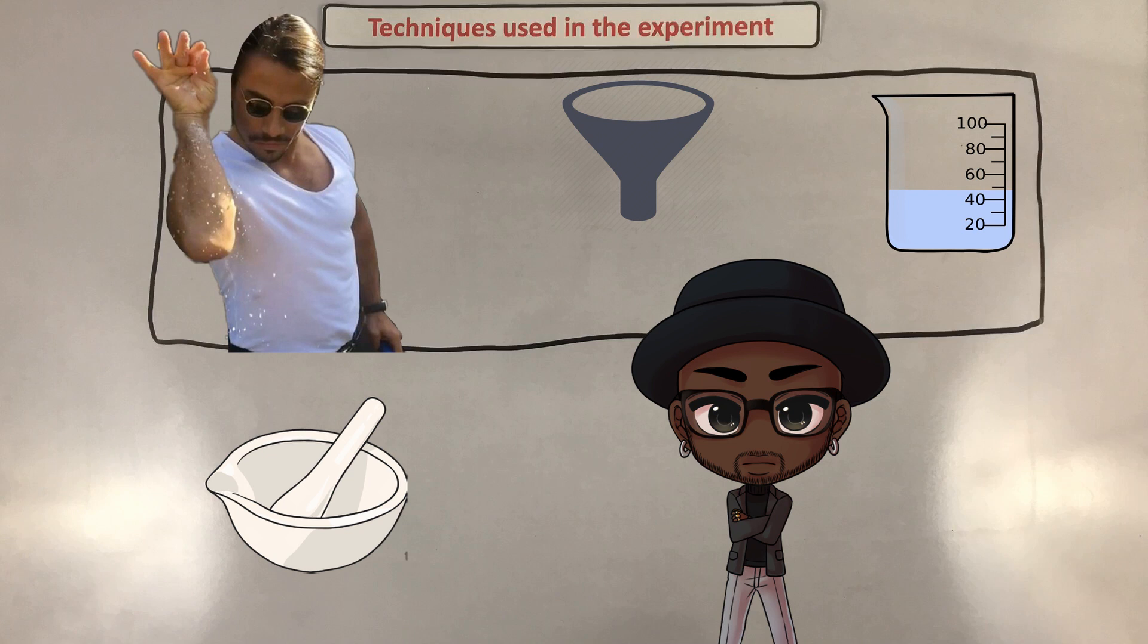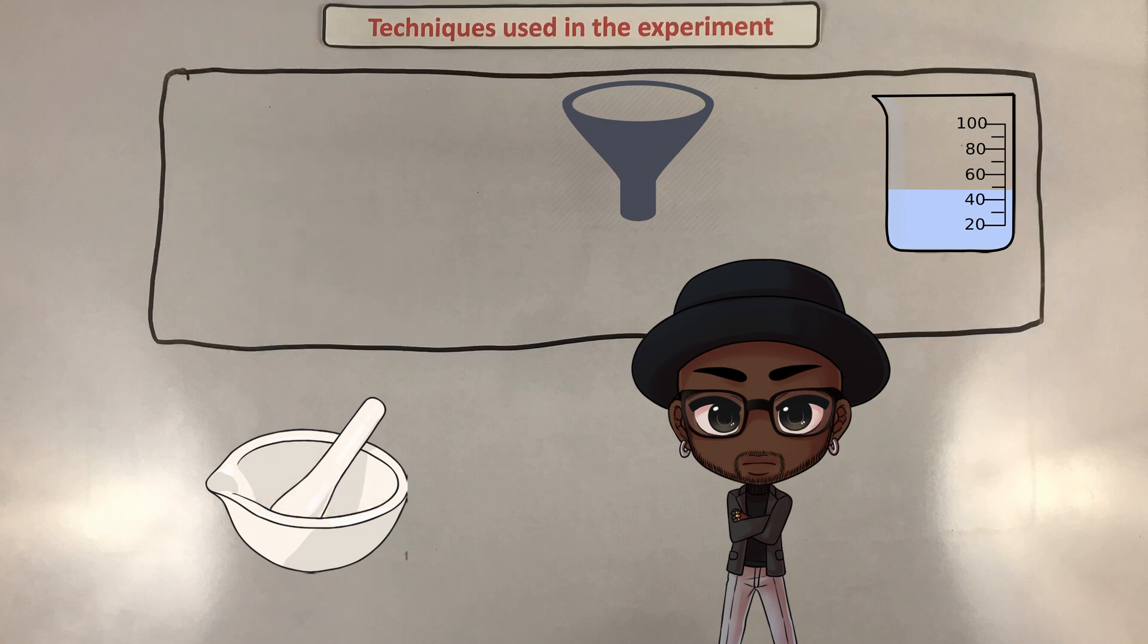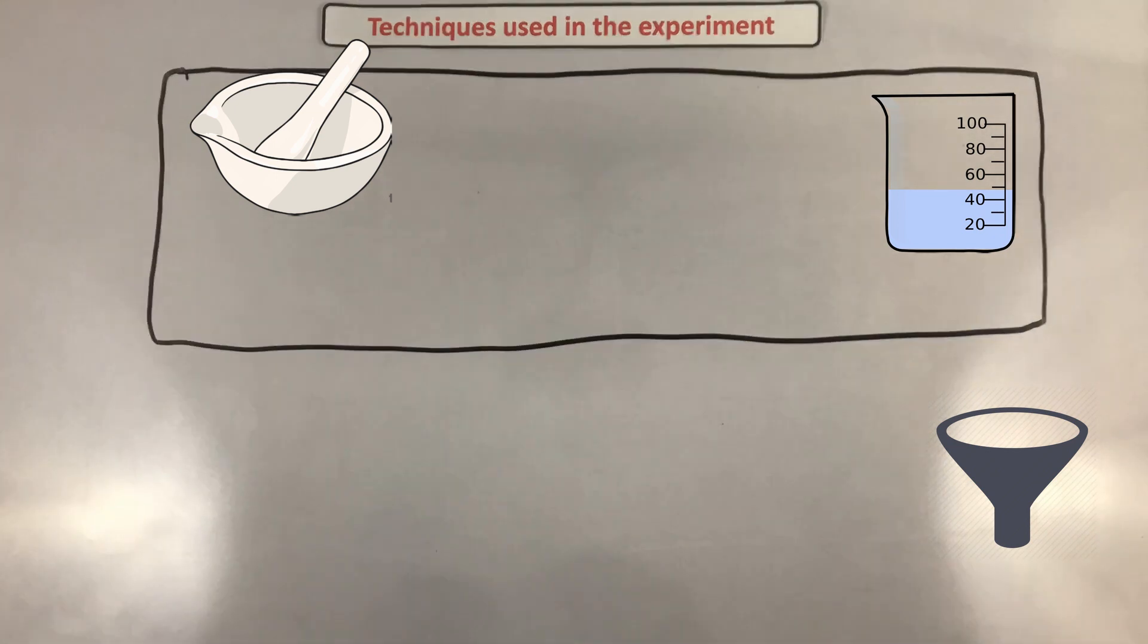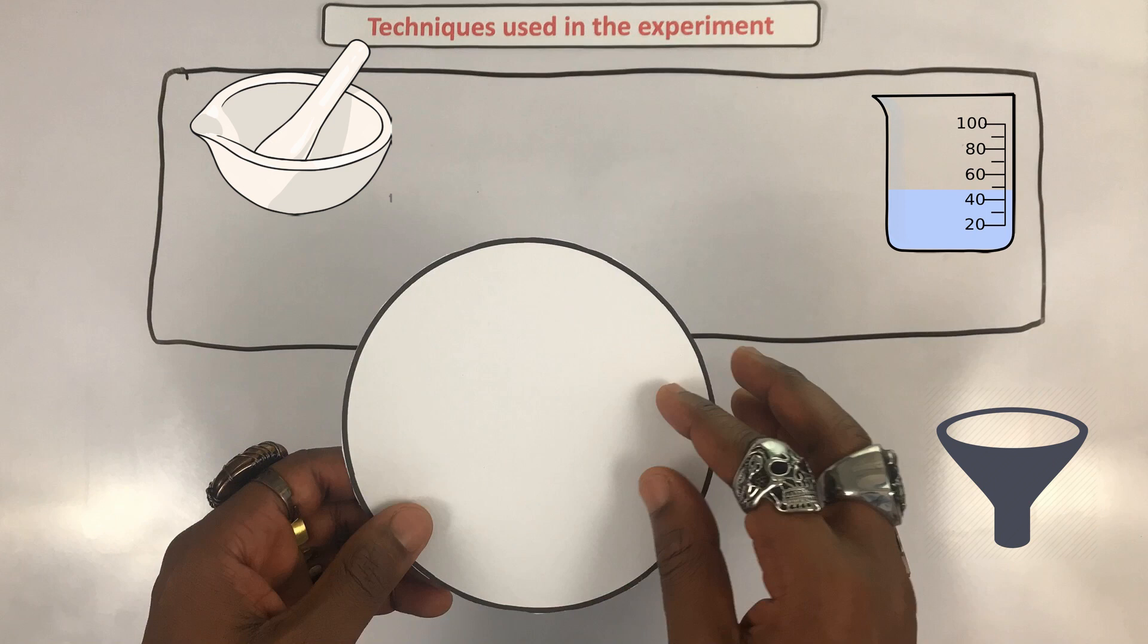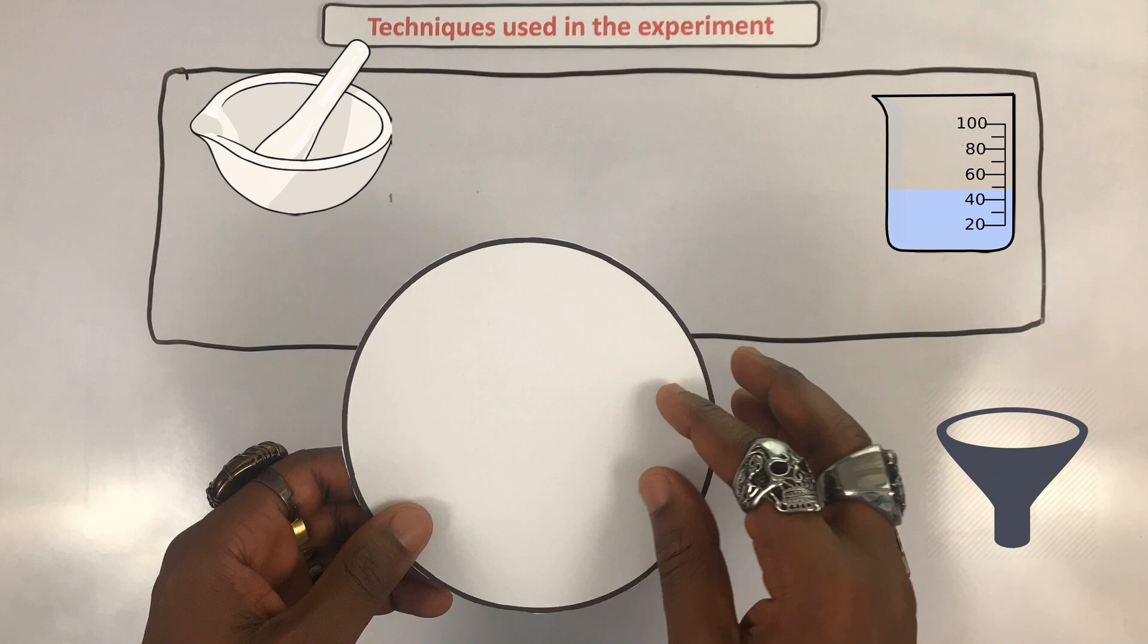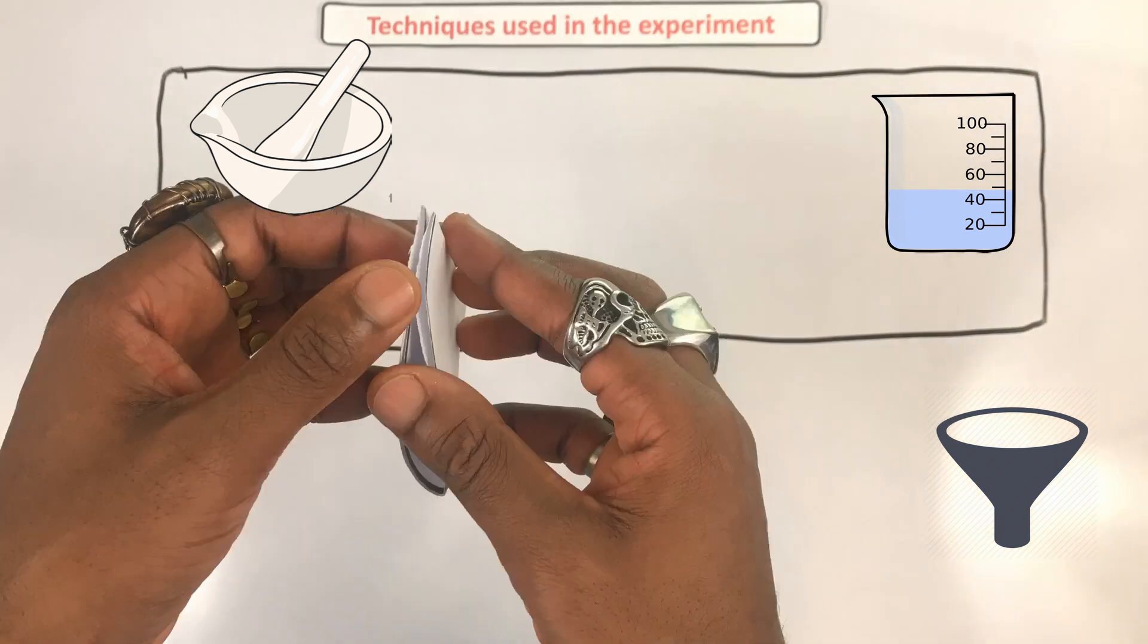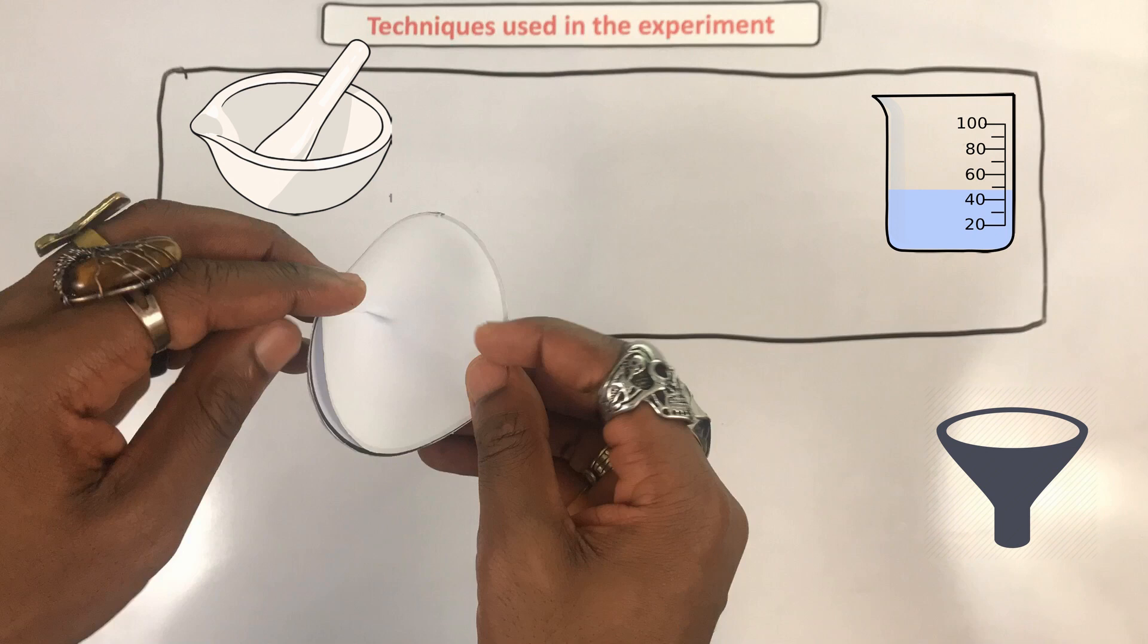The next one is filtration, which uses a special paper called filter paper. Now I don't have any filter paper at home, so I actually just use regular paper. This has very small gaps inside it that allows dissolved substances to move through it while your larger insoluble substances stay up here. The liquid that filters through is called your filtrate. The first step is to get your filter paper and fold it in half, and then fold it in half again like this. Now this next bit is critical: open it up so you make a cone with no gap in the middle, then it goes into your funnel and the whole thing sits on your conical flask.